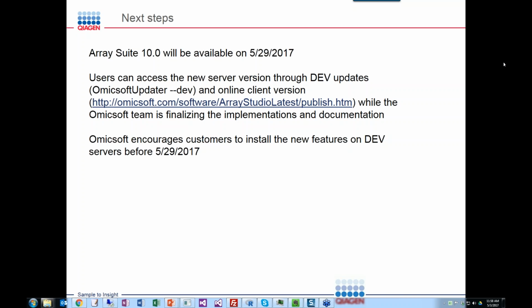There is a question on Sentieon for non-human genome analysis. I think Sentieon was optimized for human and mouse, but for other species, because we don't really have those kinds of dbSNP known variant analysis, I don't think it's optimized. But GATK itself is still the gold standard, so whatever GATK provides, I think Sentieon will have that advantage.